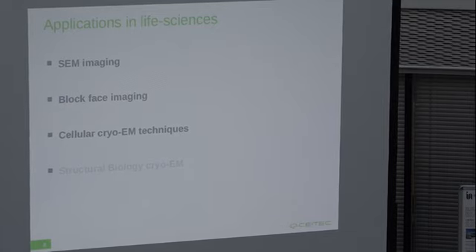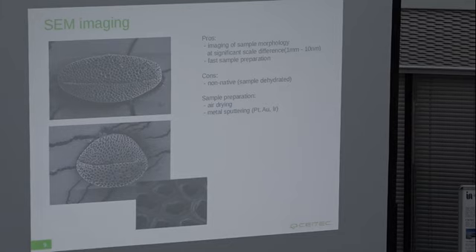And as I mentioned, I will not go into any structural biology, as we have a much better speaker to cover this topic afterwards. All right, so as I said earlier, the scanning electron microscope can be used to study morphology.